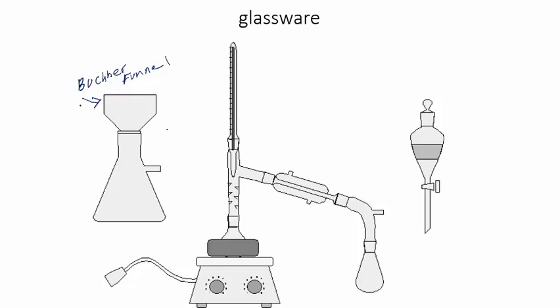This is a Buchner funnel because it has these square edges here. It's meant for larger things. A Hirsch funnel looks sort of like this. So that's a little different. It has a little tiny frit in the bottom that holds the tiny piece of filter paper. It fits in the same way. And that's a Hirsch funnel.